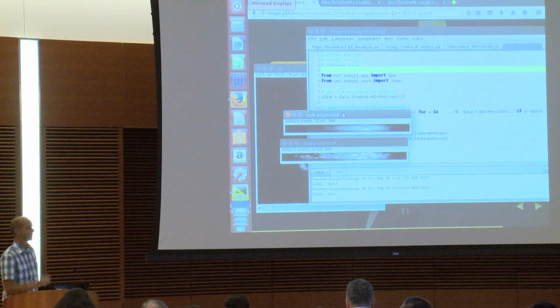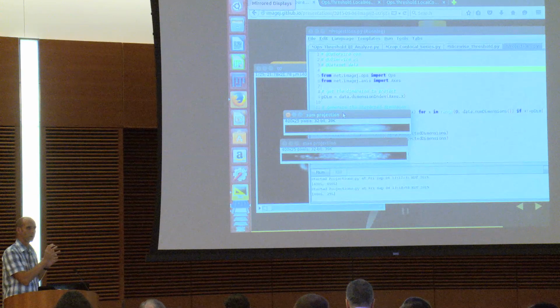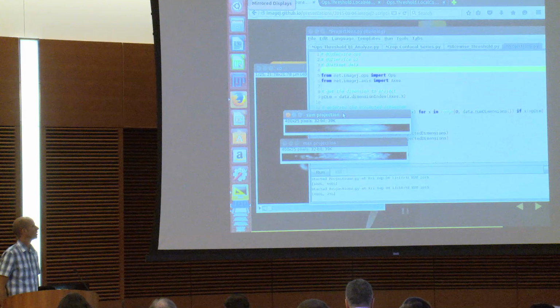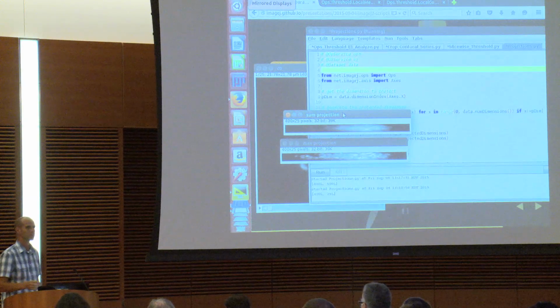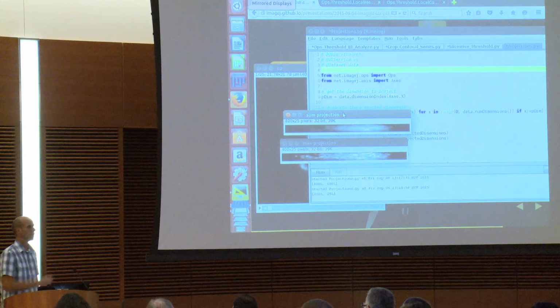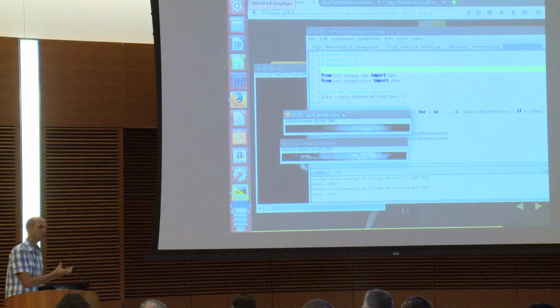So learning how to think in this way, like passing ops to other ops, is going to be really valuable, because somebody might come up with a new way to project data, or a new statistic that you'd like to use for your projection. So there might be simple ways to access the max projection, the sum projection, but to do this new type, when it's bleeding edge, you're going to have to go back to the sort of mixing and matching style. So as an ops programmer, it's useful to know how to do these types of workflows.